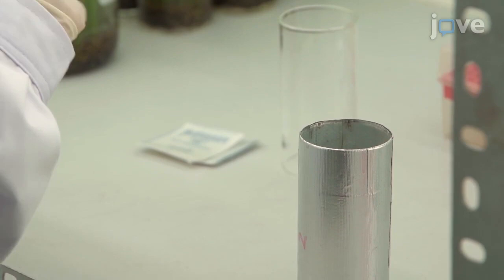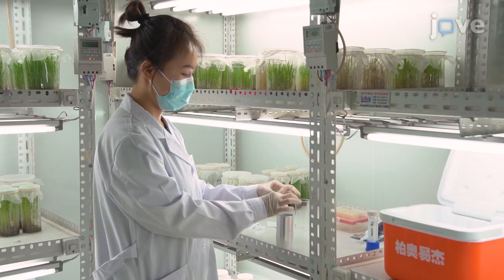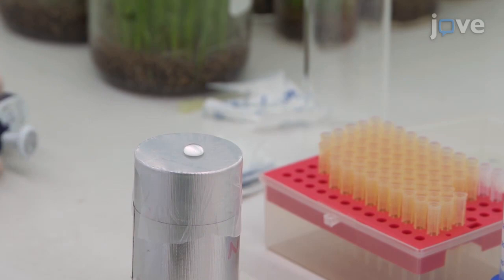Next, to prepare the glass cylinders as feeding chambers, cover one open end of the chamber with a paraffin membrane before introducing the experimental insects. Then, transfer the insects into the glass cylinder and cover the other end of the chamber with stretched paraffin membrane. Add 200 microliters of artificial diet on the membrane.